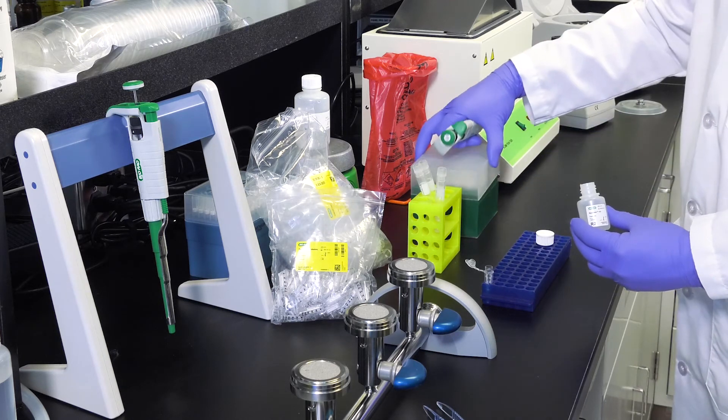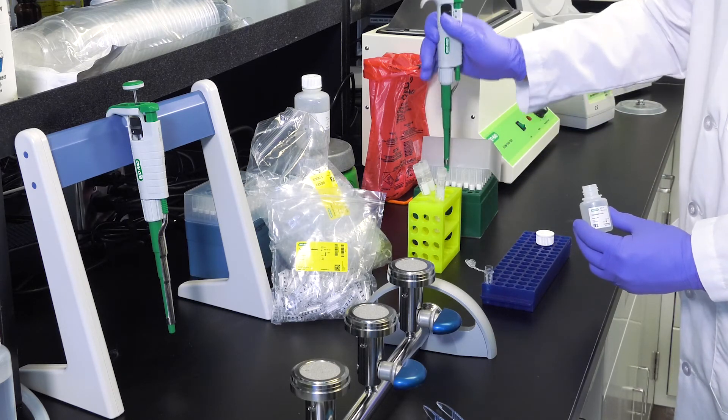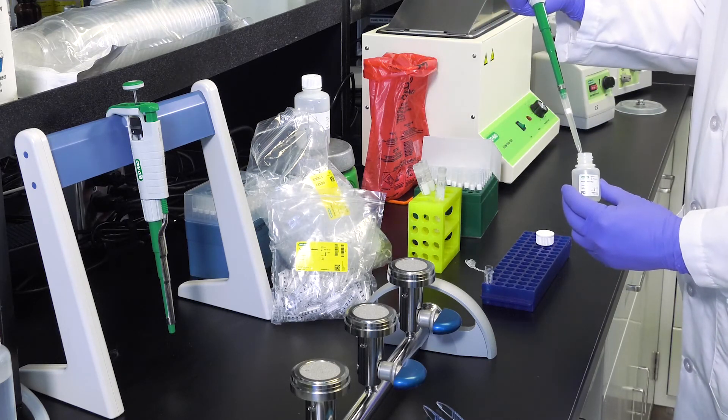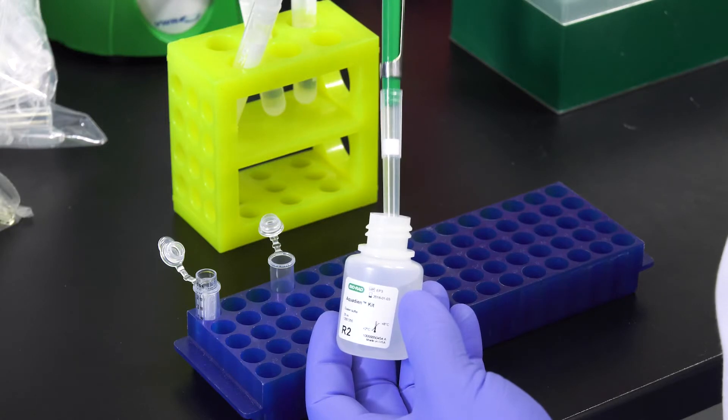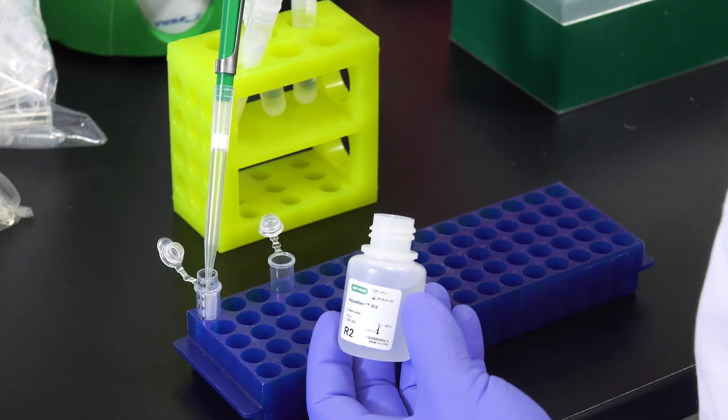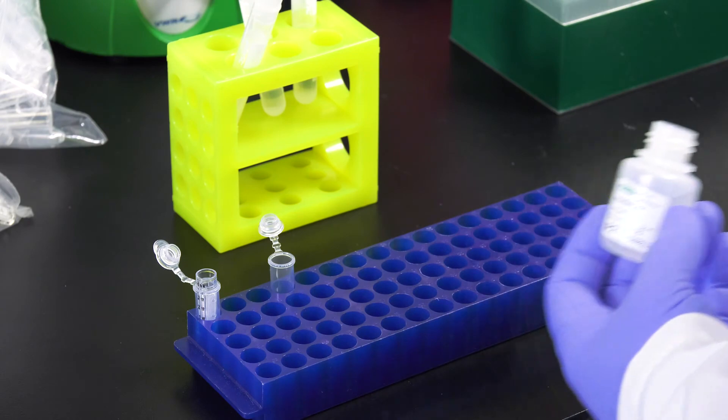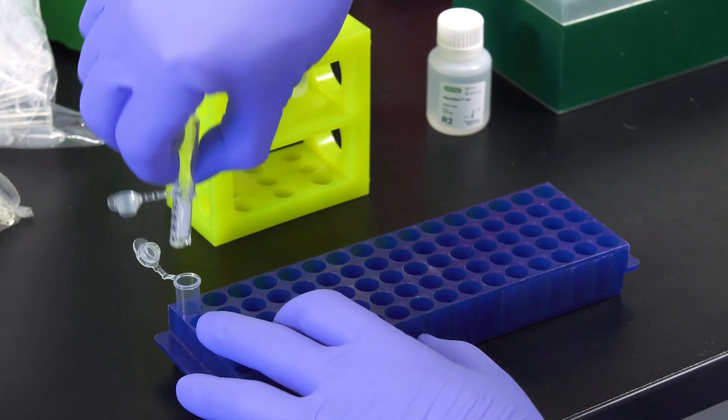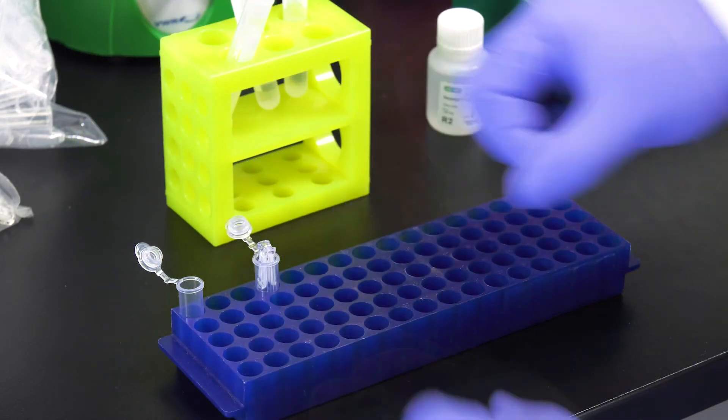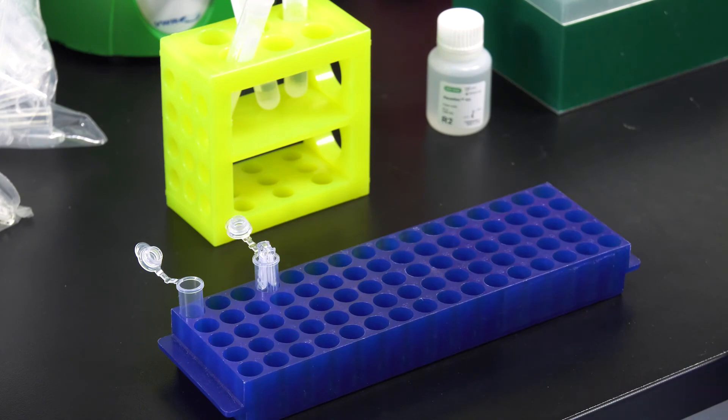The next step is to elute the DNA from the column. To do this, add 100 microliters of R2 solution to the purification column and throw away the collector tube. Cover the purification column with a clean collector tube and turn the whole thing upside down, transferring the column to a new tube.